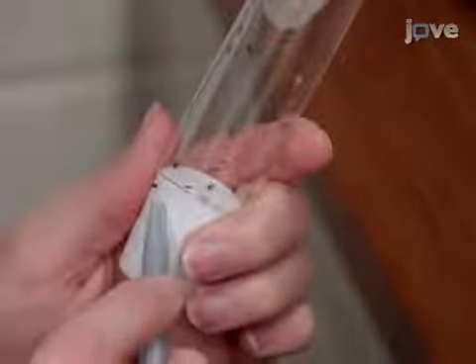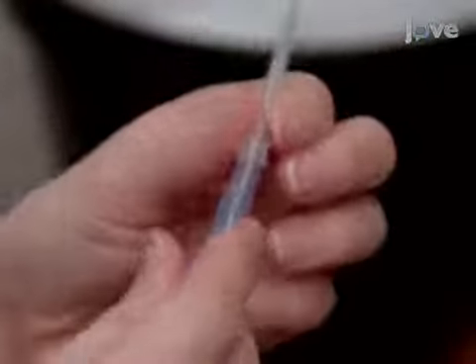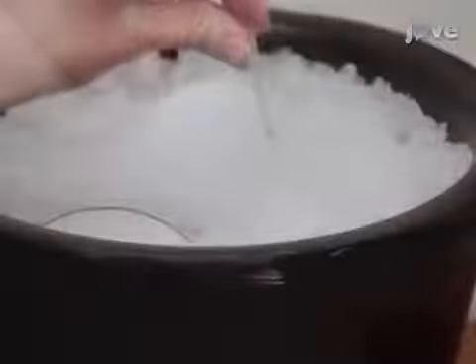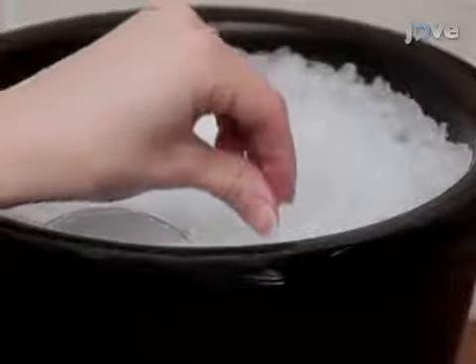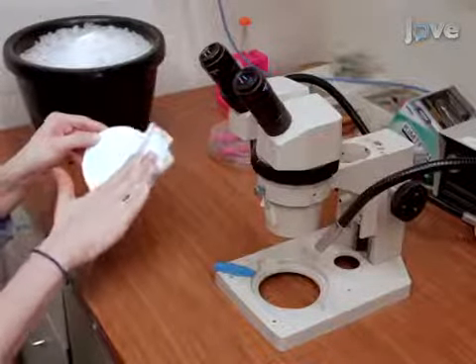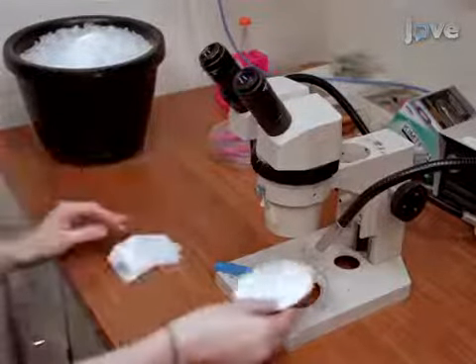After that, aspirate a fly into a P200 pipette tip. Place it in an ice bucket and chill for 30 seconds to 1 minute. Next, remove the microscope plate from ice and position it under the microscope after wiping off the moisture. Then, gently tap the fly.